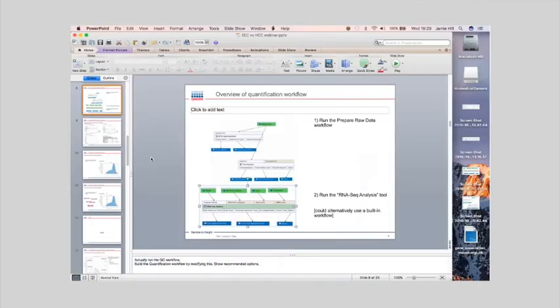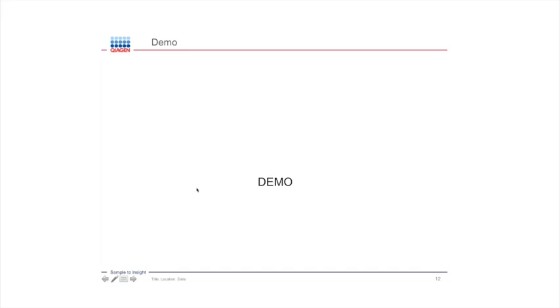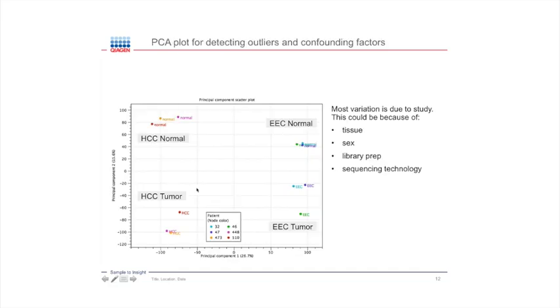And now I want to explain what it actually is that I've done, why I'm showing this, and how it's all working underneath. This is the principal components plot that I was showing you before. It's just been recolored slightly here, but it's the same data. And the same thing that I was showing before, that the difference between the two studies is much greater than the difference between tumor and normal. That's the second principal component, tumor and normal. So that's something we have to correct for when we compare one cancer down here with the other cancer over here.